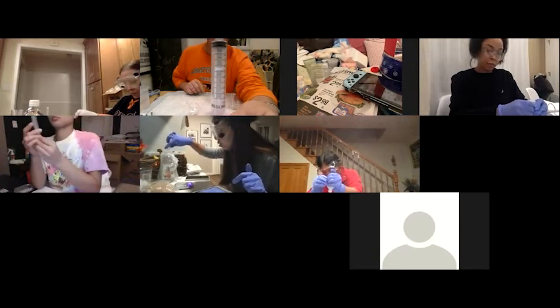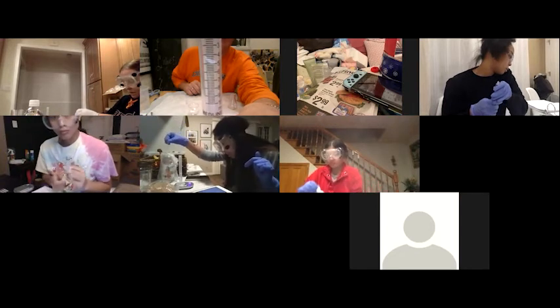So this here's a 10 ml syringe, and you can see that there are 5 marks in between each mil. So it's going to be kind of tricky to get 0.1. 0.2 mils we should be able to get. So anything in between, remember these are 0.2 milliliter increments. So remember that when you're measuring your volume. They're not 0.1.